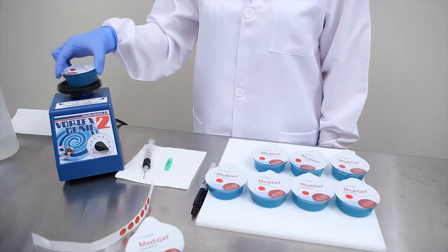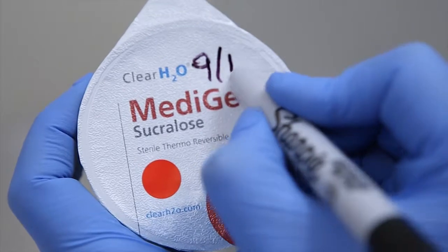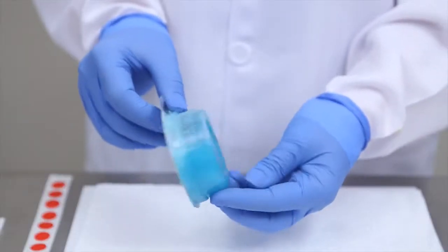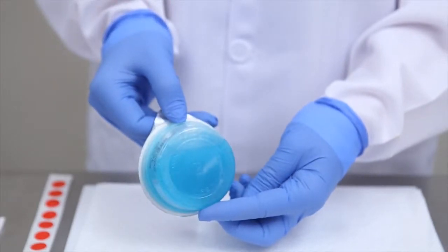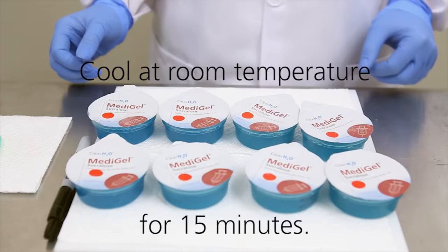Once complete, write the date on the cup lid of each cup to aid in tracking and inventory management. The cups of liquefied Metagel sucralose will re-solidify when allowed to cool at room temperature for a period of approximately 15 minutes.